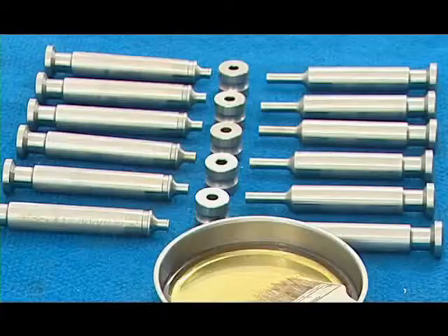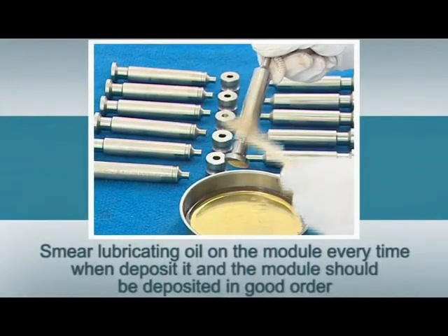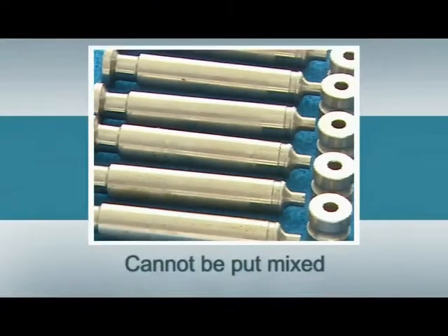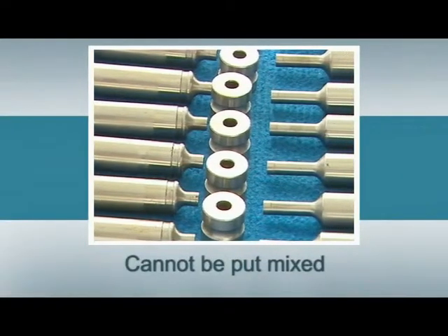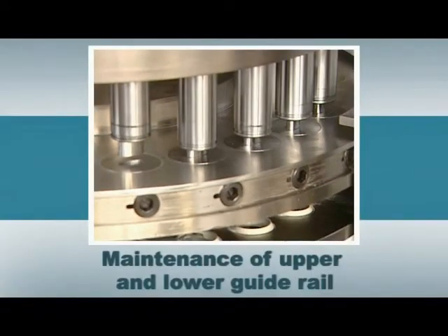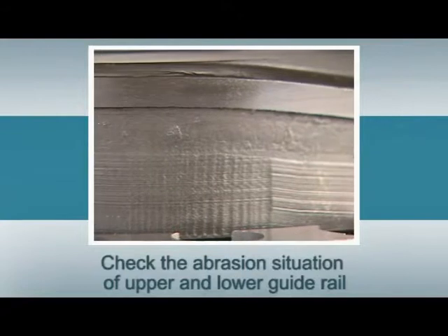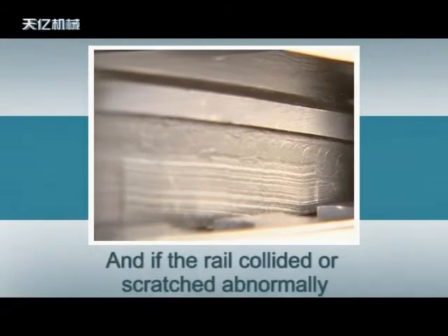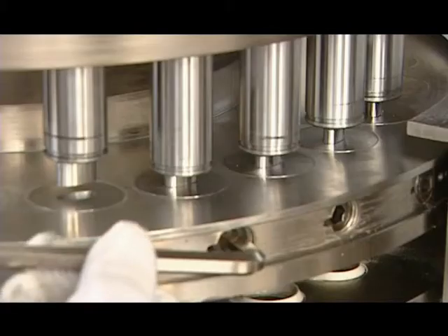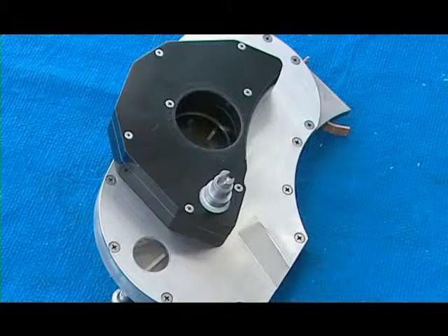Maintenance of a module. Smear lubricating oil on the module every time when disposing it, and the module should be disposed in good order, not put mixed. Maintenance of upper and lower guide rail. Check the abrasion situation of upper and lower guide rail. If the rail collided or scratched abnormally, check if the fastening screws on the module are loose.